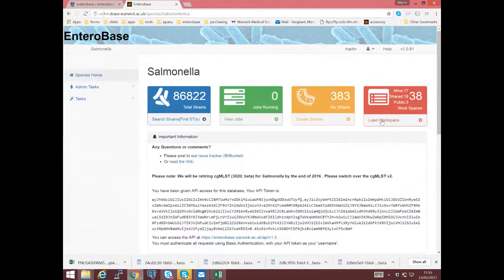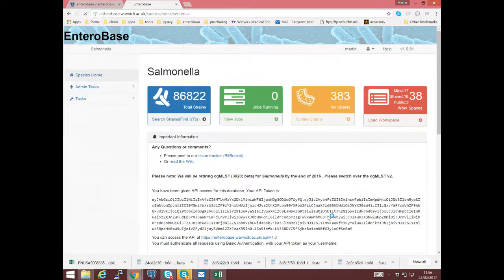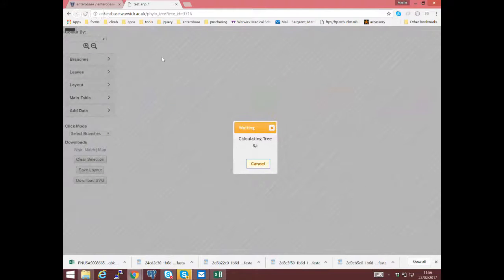Okay, so we shall load the tree that I created last night. Oh, hang on.